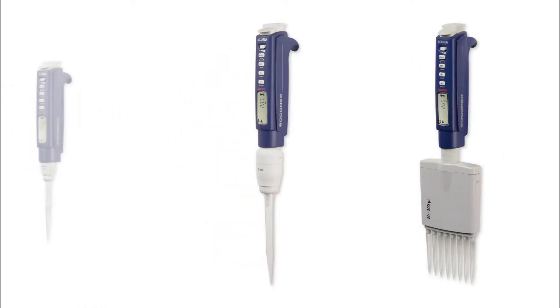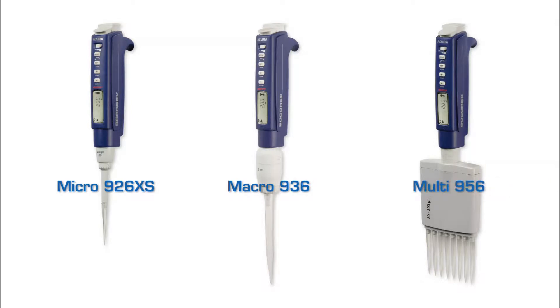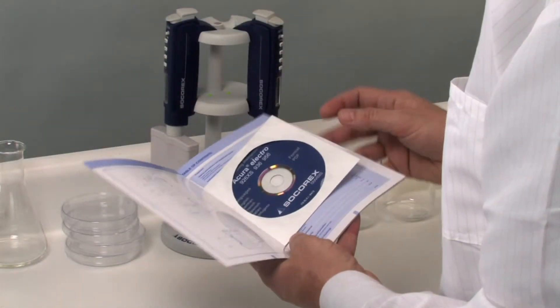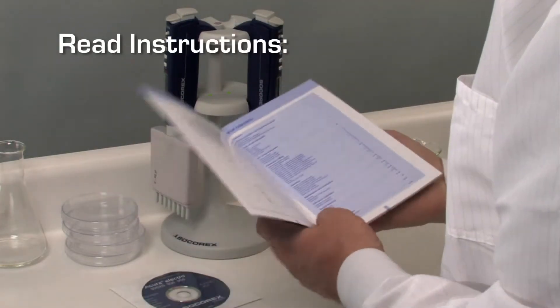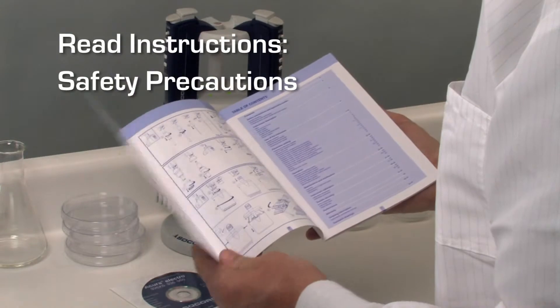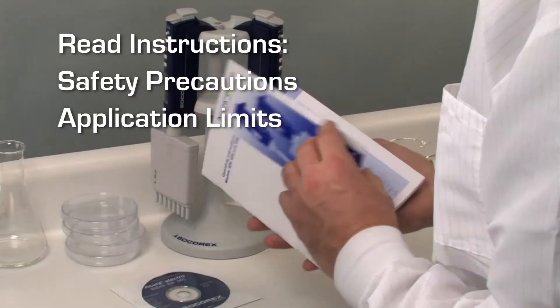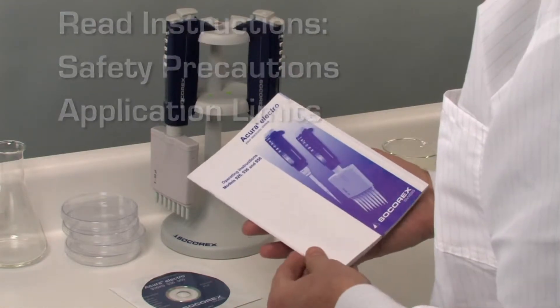Welcome to the world of precision instrumentation. This video details the flexible use of the Acura Electro pipette family. Before using the Acura Electro for the first time, please read the instructions carefully. Special attention must be paid to safety precautions and the application limits. This information is also available as a PDF document on a CD supplied with the instrument.